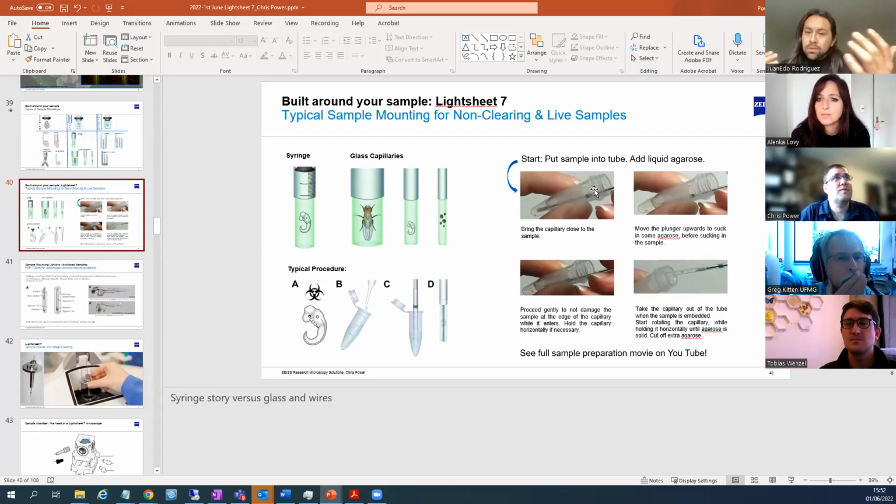How do you deal with multi-view fusion when you have, for example, samples that are not homogeneous, so then you probably have scattered light not in the same range between the two illuminations, so one side could be a bit more defocused? Is that done automatically with the software, or do you have to check that manually to set the parameters?